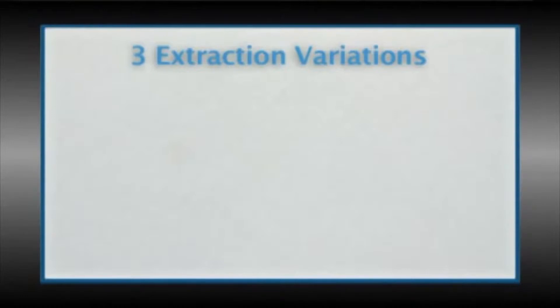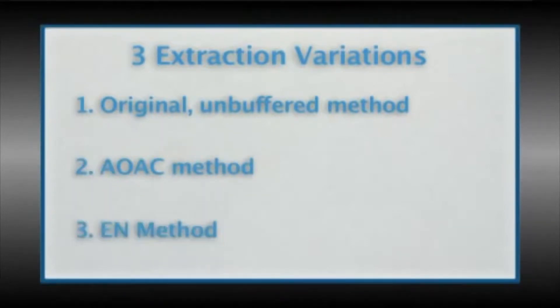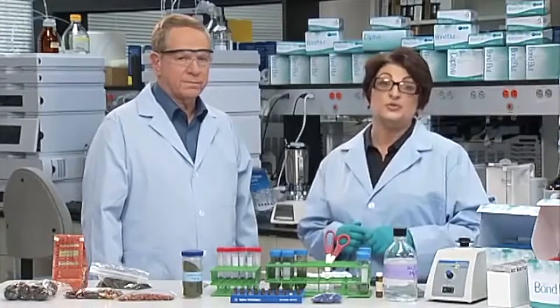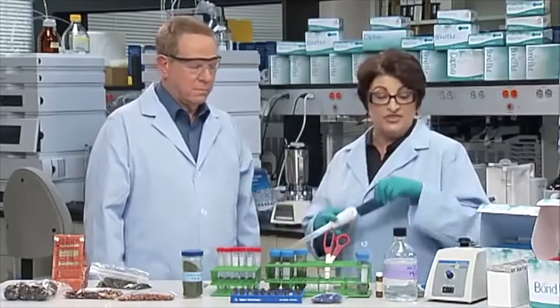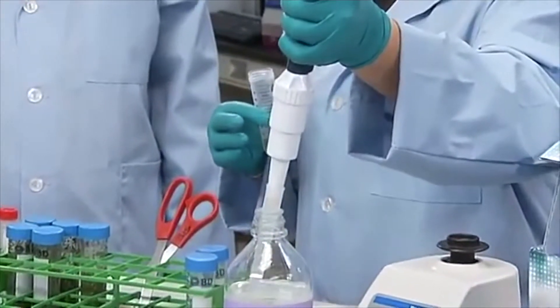Add water to compensate for the difference in weight to produce the required aqueous environment. There are three extraction variations of the first step of the QuEChERS method. These variations are the original unbuffered method, the AOAC method, and the EN method. Download the notes that accompany this video to learn specific details, like standard operating procedures, for each version. Today, I am employing the AOAC version of the QuEChERS method, which will require 15 grams of total sample. If I add 5 grams of my ground tea into a 50 milliliter centrifuge tube, I would then add 10 milliliters of cold water to make up the 15 grams.